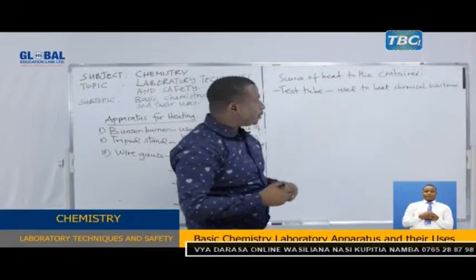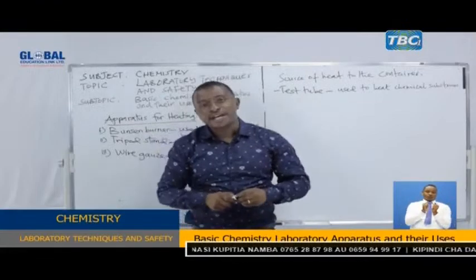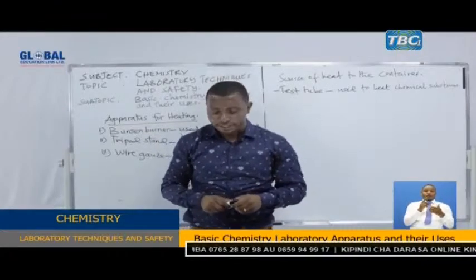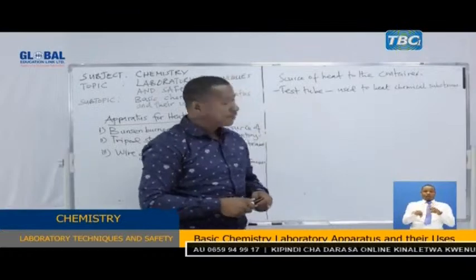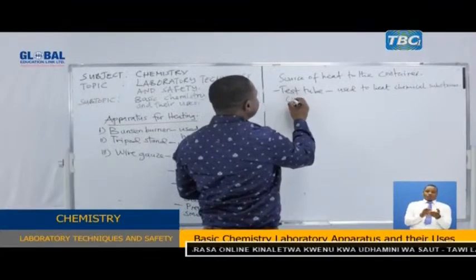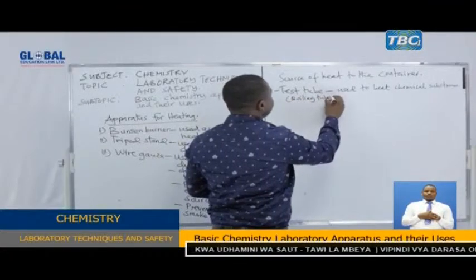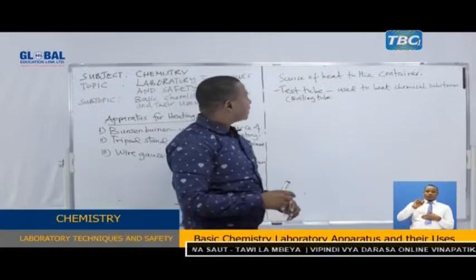So it is used to heat chemical substances, or it contains chemical substances to be heated. That is the test tube, or sometimes called the boiling tube.